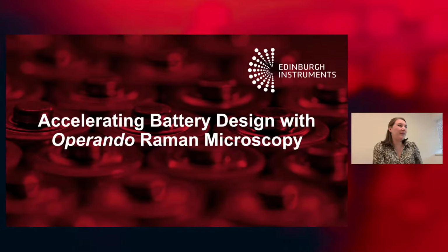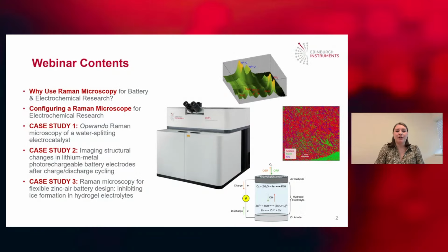Okay, sorry about that, a few technical issues, but today we're going to be discussing accelerating battery design with Operando Raman Microscopy. In this webinar, we're going to cover why you'd use Raman microscopy for battery analysis, how you might want to configure your Raman microscope for these measurements, and then we're going to go over 3 different case studies. The first looking at an operando measurement, the second looking at electrode degradation, and the third looking at the composition of an electrolyte.